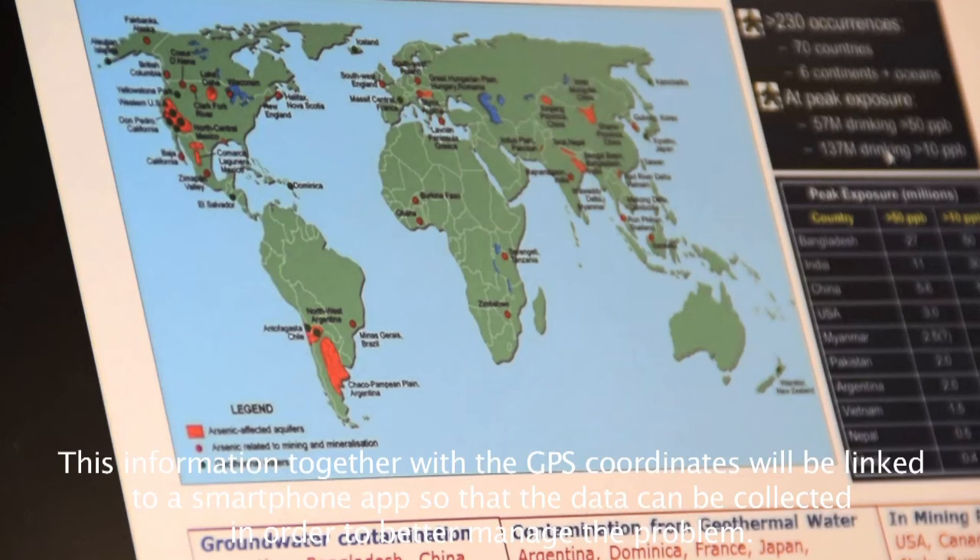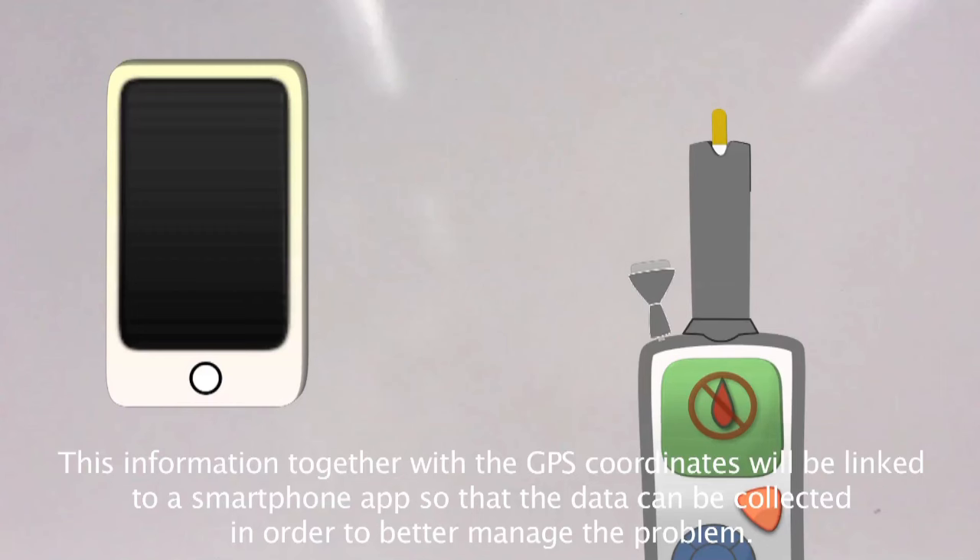This information, together with the GPS coordinates, will be linked to a smartphone app so that the data can be collected in order to better manage the problem.